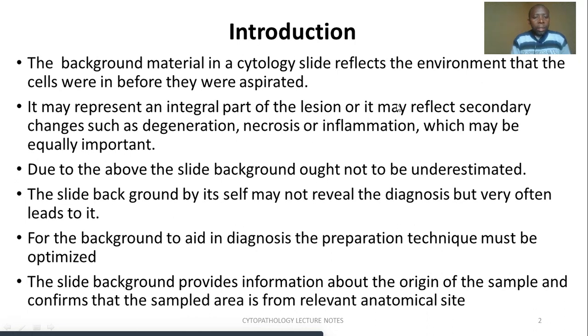In this I mean the procedure of preparing the slide must have been done in a very systematic manner, so that what we see in the background is not a result of our mishandling of the specimen, but is representative of where the cells were before.